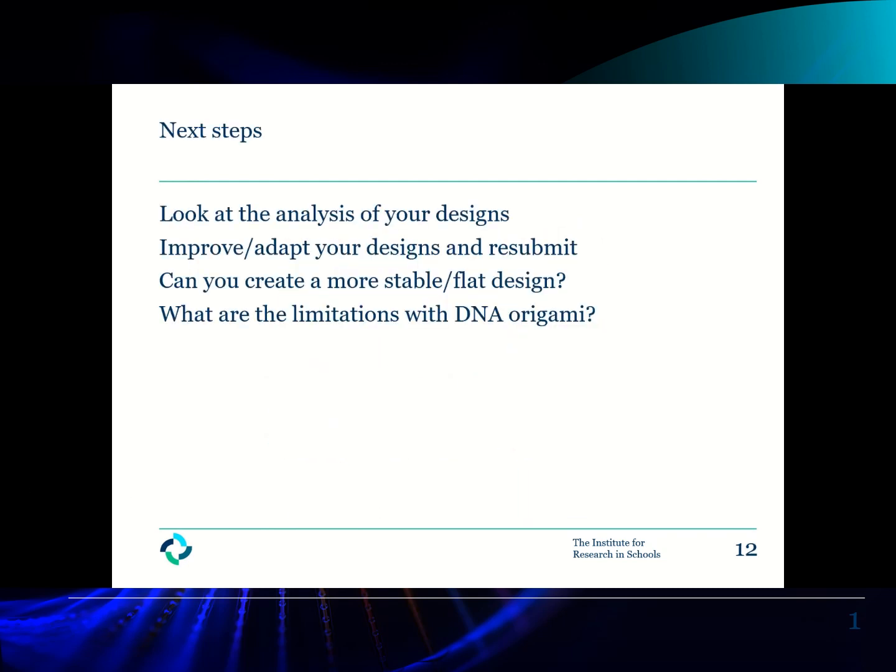So next steps on this project would be to look at the analysis of your designs. Are you able, with the analysis that will get sent back to you, to improve and adapt your designs? You're welcome to resubmit these, and you'll get more feedback as you go, hopefully looking at improving your designs. Are you able to create a more stable or flat design, or are you interested in having a big twist in your design? So something to consider when you get the analysis back.